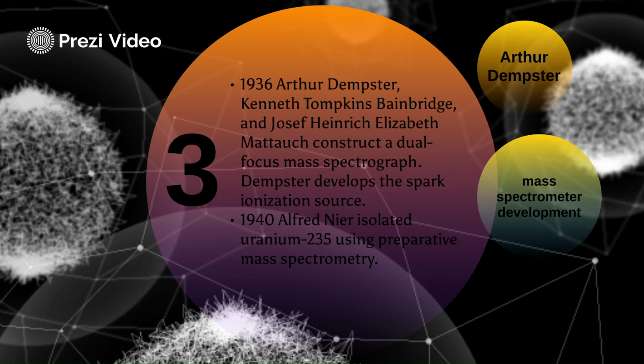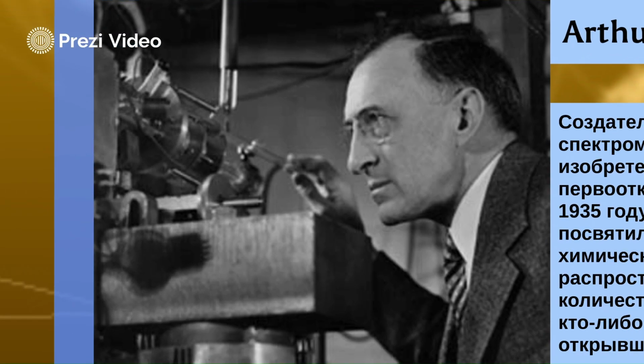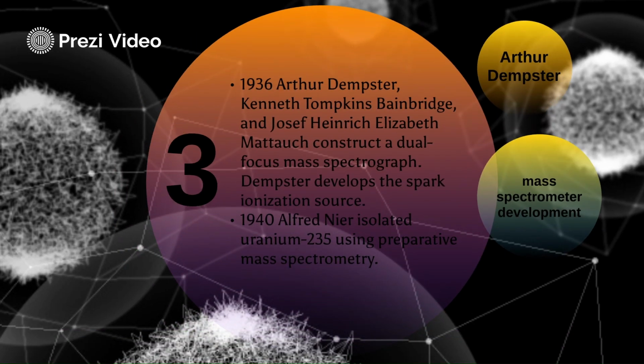Positively charged atoms on the way between the anode and cathode may lose one or more electrons, and for this reason may be accelerated to different energies. Atoms of the same type with the same charge and mass, but with a certain spread in final velocities, will draw a curved line, a segment of a parabola, on a luminescent screen or photographic plate. In the presence of atoms with different masses, heavier atoms, with the same charge, will deviate from the central axis less than lighter ones. Figure 3 shows a photograph of parabolas obtained on a Thomson mass spectrograph.